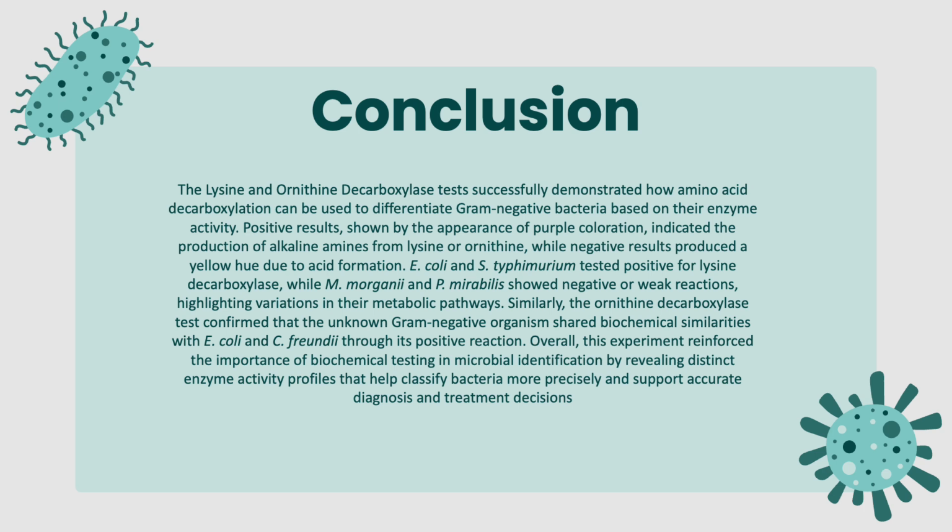Similarly, the ornithine decarboxylase test confirmed that the unknown gram-negative organism shared biochemical similarities with E. coli and C. freundii through its positive reaction. Overall, this experiment reinforced the importance of biochemical testing in microbial identification by revealing distinct enzyme activity profiles that help classify bacteria more precisely and support accurate diagnosis and treatment decisions.